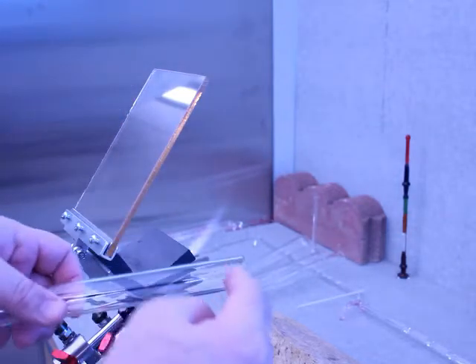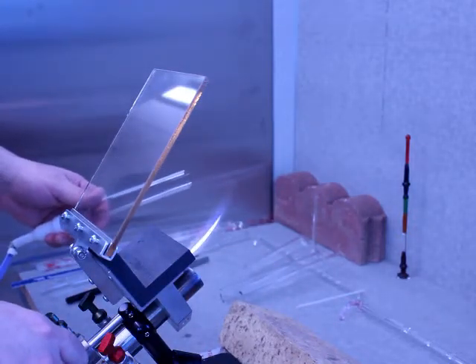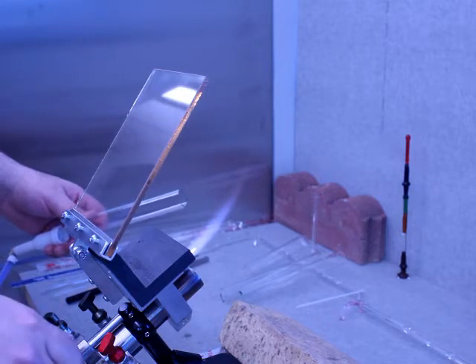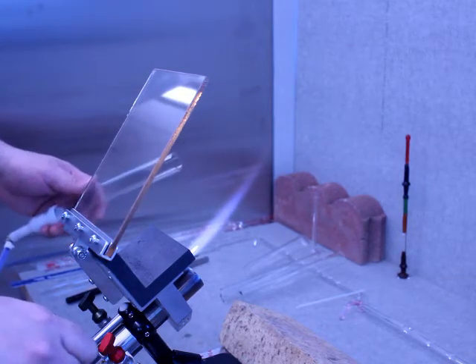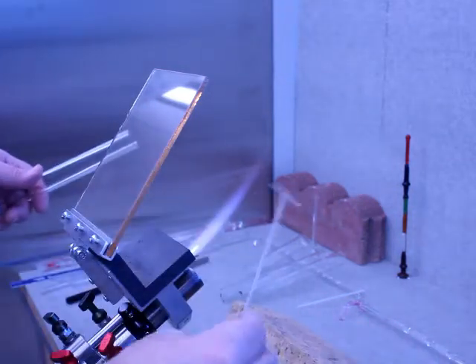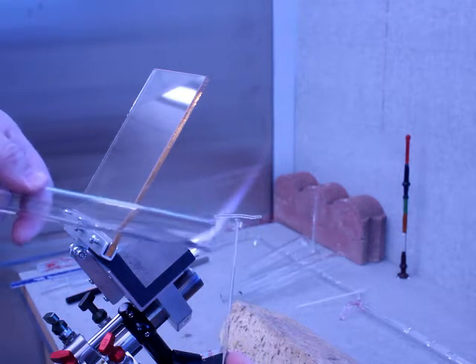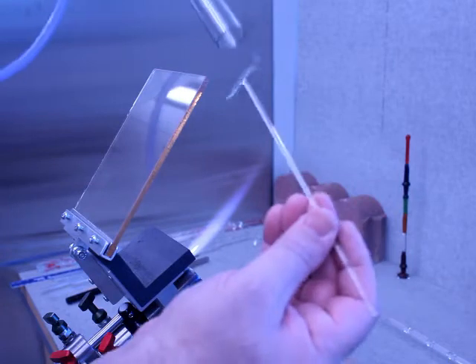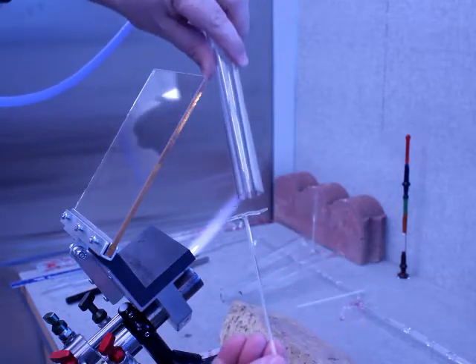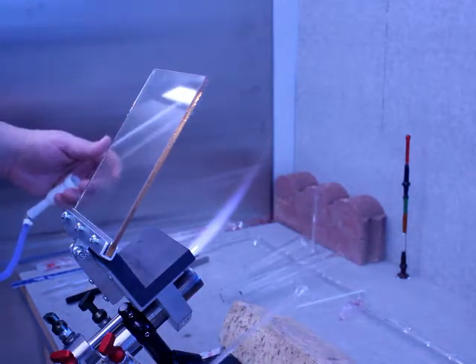Now, this end has not been fire polished, and that's okay because the intention is to completely remove it in making the round bottom, which will be the top of the oil bubbler. Now what I've done is I've taken some 3mm glass and I've put about an inch and a half centered to make a little T here. And the idea is I'm going to get both sides hot, touch them together, and this will be my handle so I can pull off the excess glass.